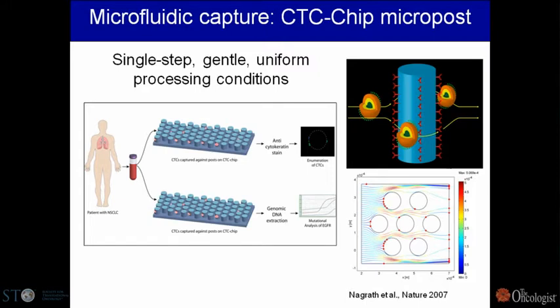You're passing 2 to 4 mils of blood over 2 to 4 hours through one of these microchips. That's about like connecting a fire hydrant hose to this pointer. The amount of flow is astronomical for microfluidic devices. So a lot of attention went into how to position these posts. In fact, it's enough of a low shear device that the calculated shear stress of blood going through this device is less than blood going through the normal heart valves.